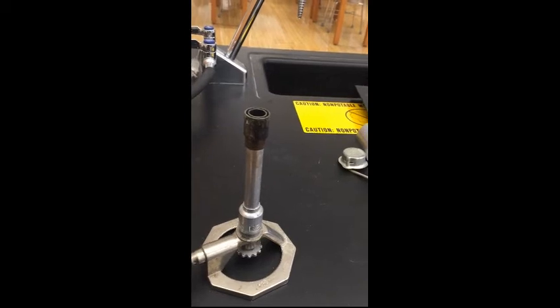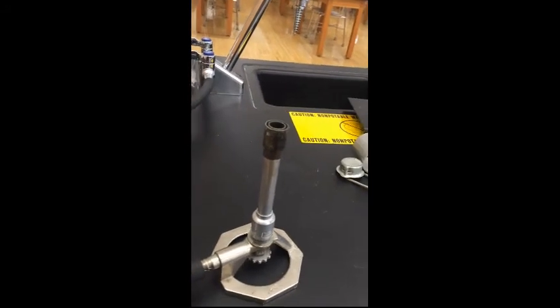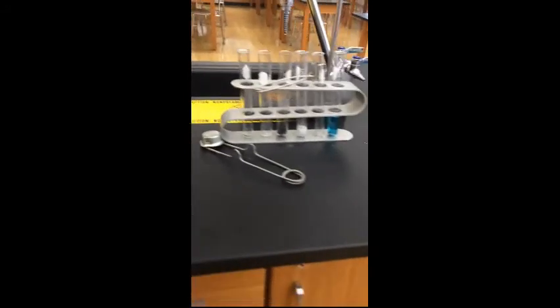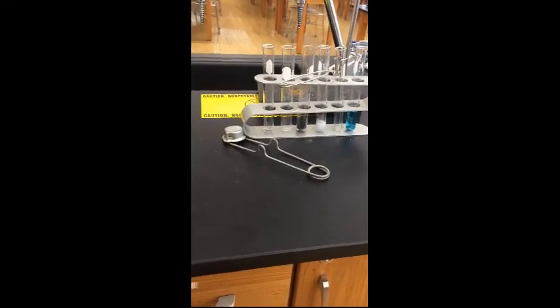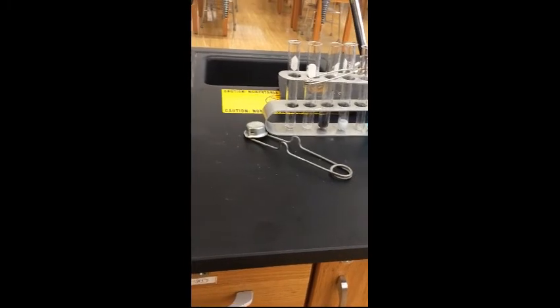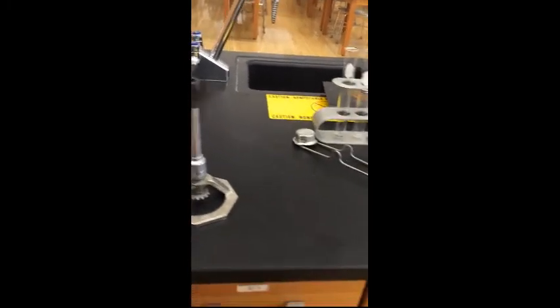Okay, so both the one we just did with the zinc and the hydrochloric acid and the zinc with the copper sulfate, both of these are single replacement reactions. The double replacement reaction is next.